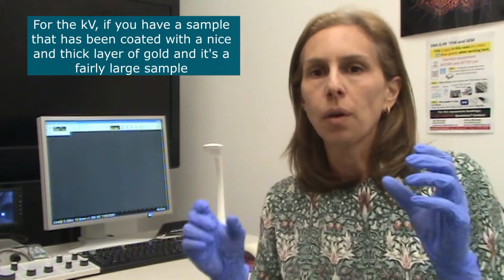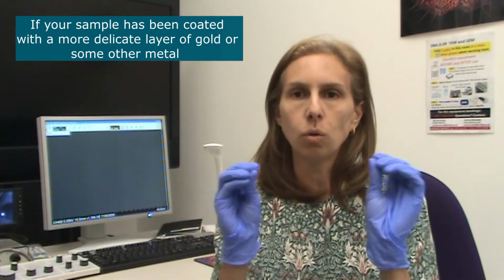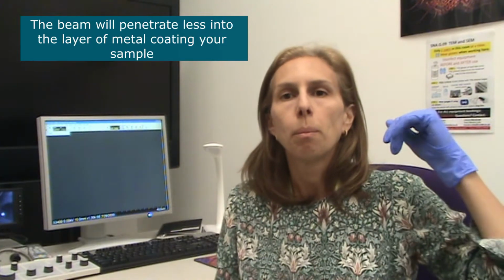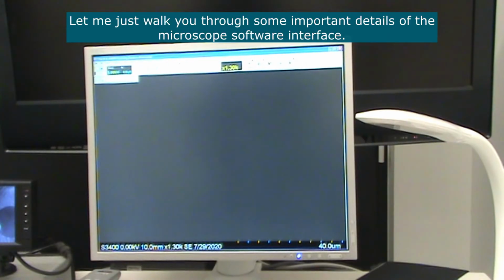For the kV, if you have, let's say, a sample that has been coated with quite a nice thick layer of gold, and it's a fairly large sample, you will be willing to use higher kV numbers of, let's say, 20 to 30 kV. Now, if your sample has been coated with quite a delicate layer of gold or some other metal, and you're interested in the surface topography, the very finer details of the surface topography, you might want to try a kV between 5 and 10. That will penetrate less into the layer of metal that's coating your sample, so it will give you less signal, but on the other hand, it's likely to give you better resolution of that surface topography, and also not damage your sample because it's a lower accelerating voltage, so your sample is exposed to less energy.